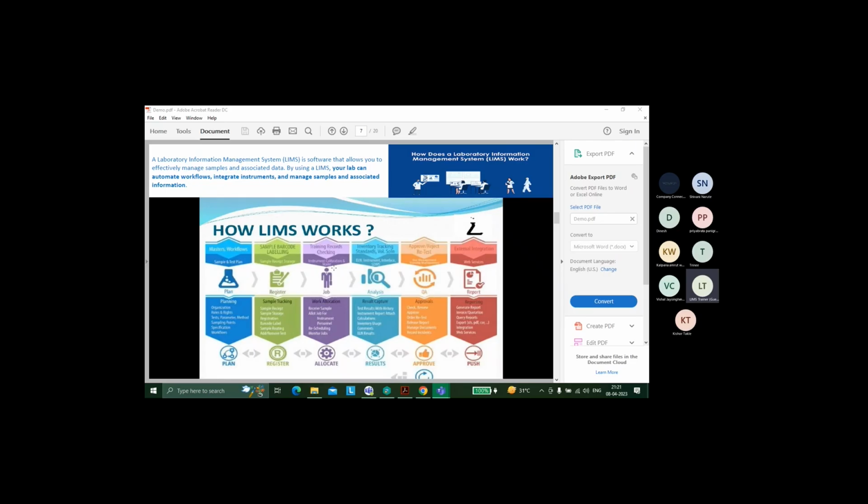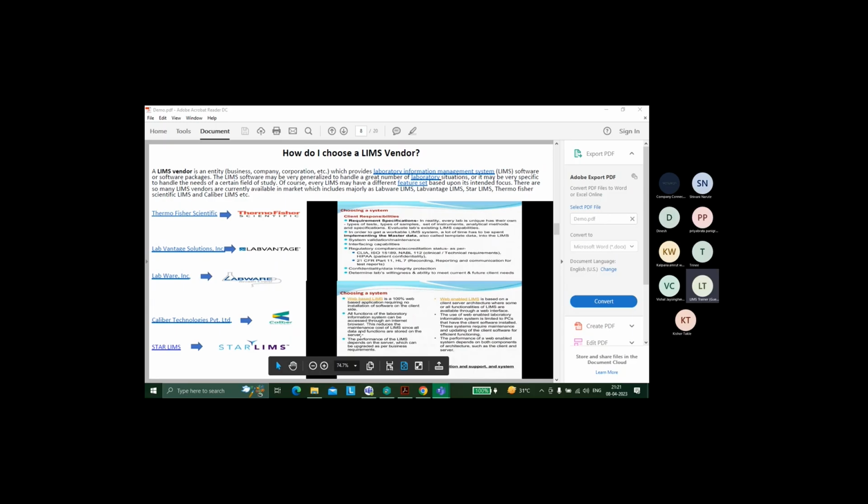We can work with standards and reagents. That's what we said, right? I said we can approve or reject samples. We can cancel samples as well. We can do external integration of LIMS. External integration means with other tools, for example chromatographic tools, for example Empower. And as said, there are different LIMS vendors.